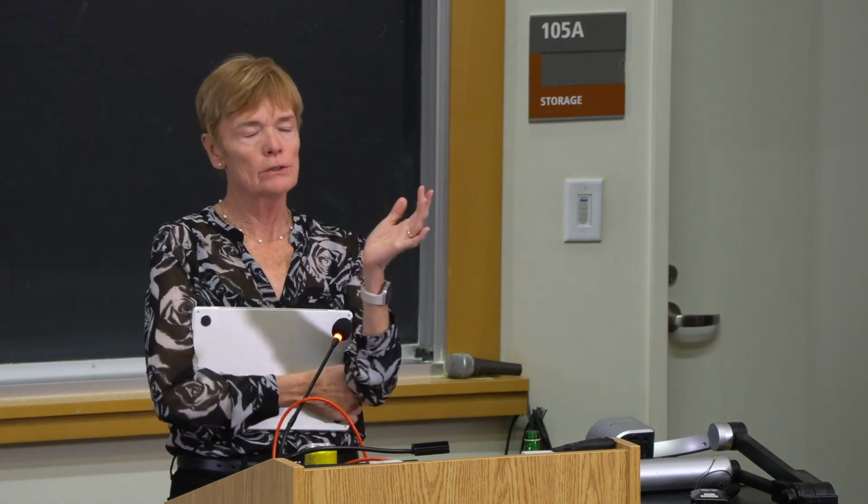It's all written up in this paper, which is on bioRxiv, but we used many approaches. And the issue was, what is ground truth? It doesn't exist. People are terrible at this. In fact, early on, we said, let's have a pickathon. We had 35 or 40 people come and spend a week at the Institute all picking. At the end of that, we threw all of their picks away because they were terrible.